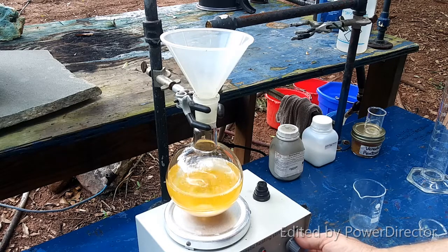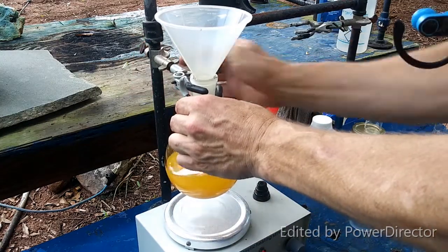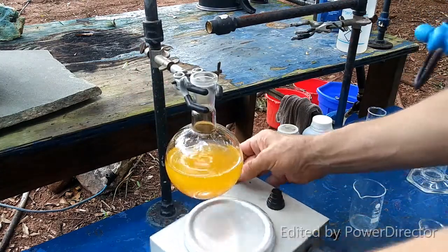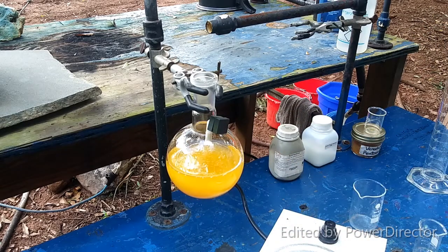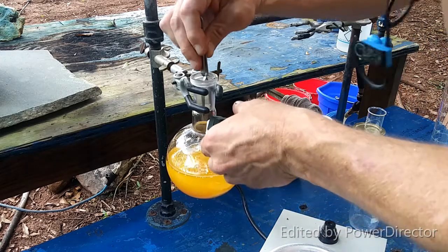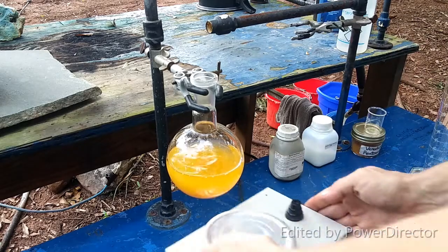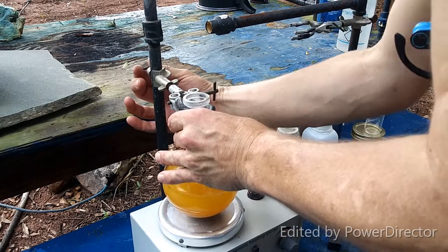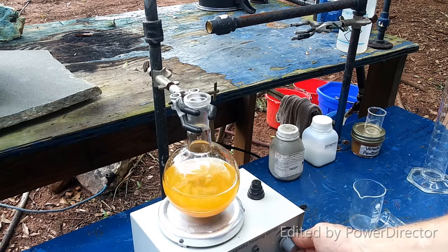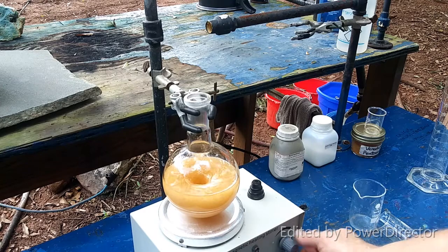Come on, you better not be pulling this crap. I will change you out — don't think I won't. Last thing I need is a damn stir bar deciding it's going to be obstreperous. If you can't do your job, we'll just change you out. Sometimes a smaller stir bar really is better.